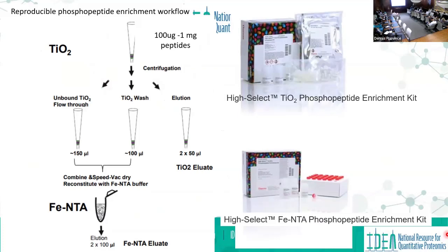So we've used a couple of different methods, and I generally don't talk nice about Thermo, even though they buy lunch and we buy instruments from them. I'll talk a little bit bad about them with these kits, because I tried these kits sometime in the early 2010s or so. I tried them and they were awful. They just didn't work at all.